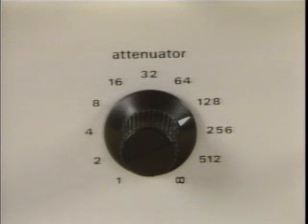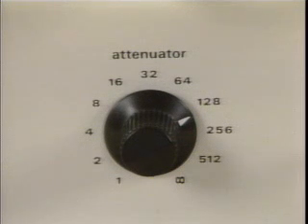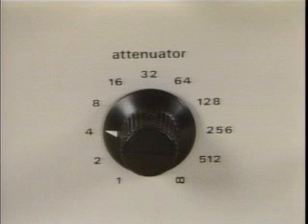Obtaining the right attenuator setting for a specific sample is often a result of trial and error. If there is no prior information on the appropriate setting, a low setting should be used so that all components of the mixture will be detected.